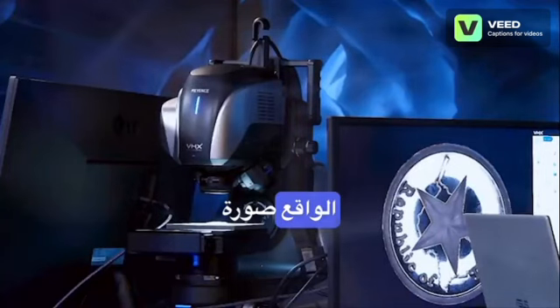And this is on top of the digital fern type of structures that we saw like 2 weeks ago, which I don't have in this sample because this is just some of the clear water. But we saw all kinds of different structures. I think now at current count, we're looking at easily 6, maybe 7 different types of life forms. And clearly some of them are bacteria, some may be forms of algae. I actually have a photo that shows what looks like a string of algae. But let's go on to the next one.